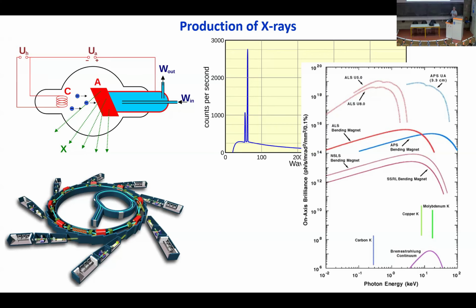And it's just as when you are driving, there is centrifugal force in the turns, which means that because the electrons are already spinning at the speed of light, they cannot go any faster. So to avoid going faster, because they cannot, they just emit energy, and they emit energy in the X-ray range.